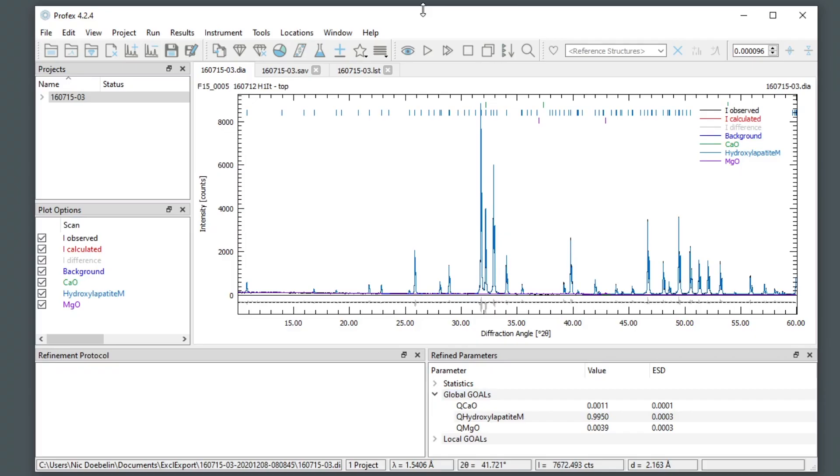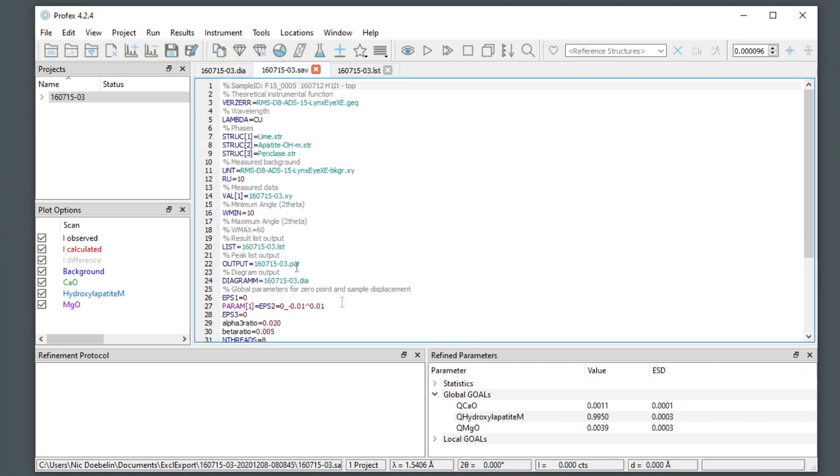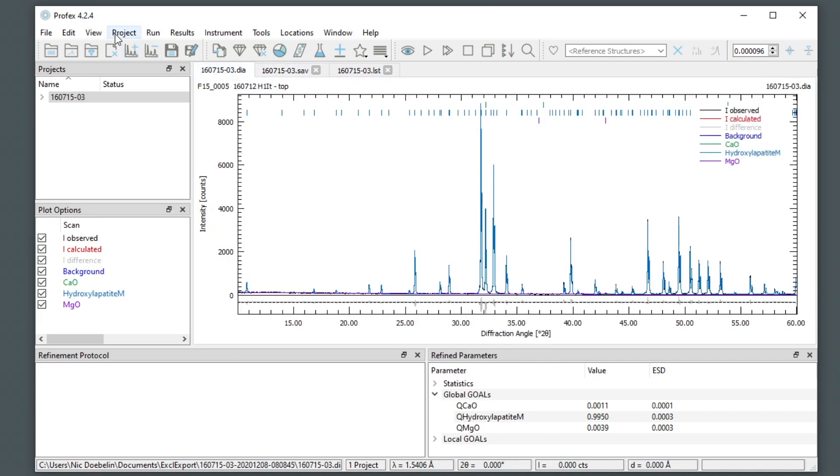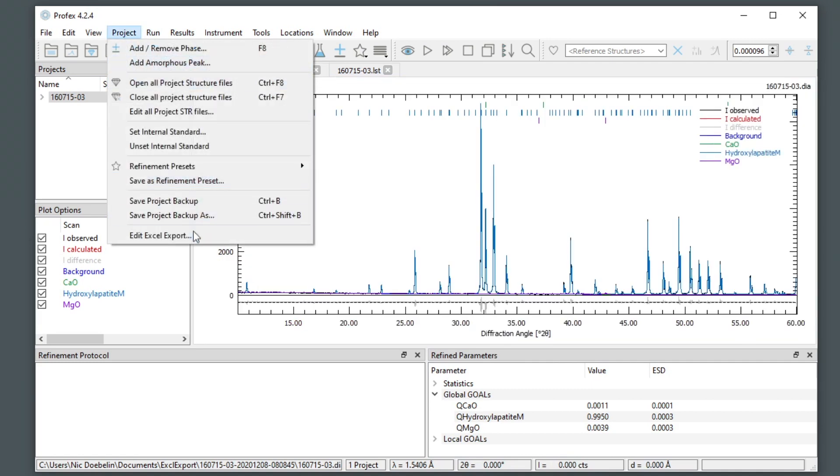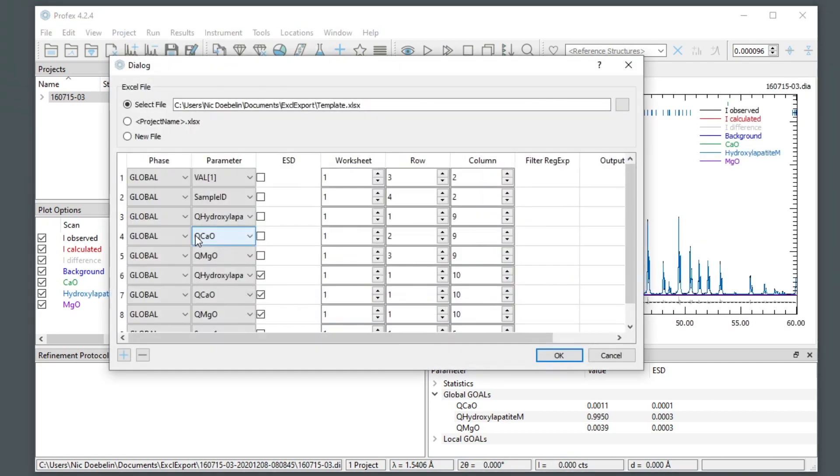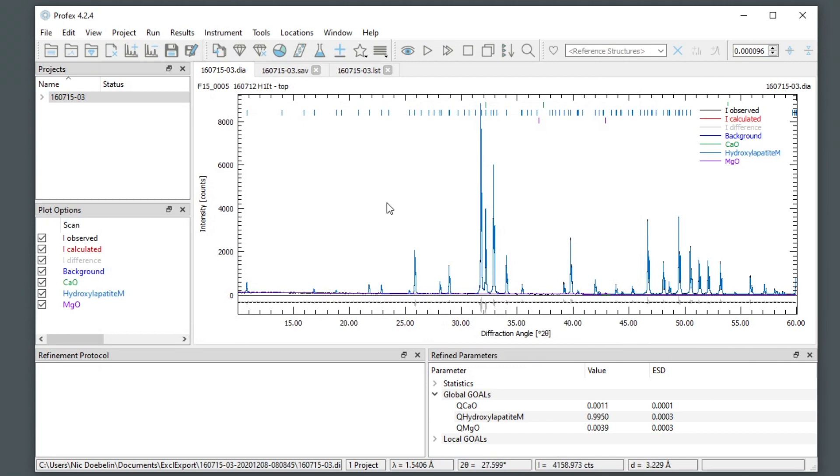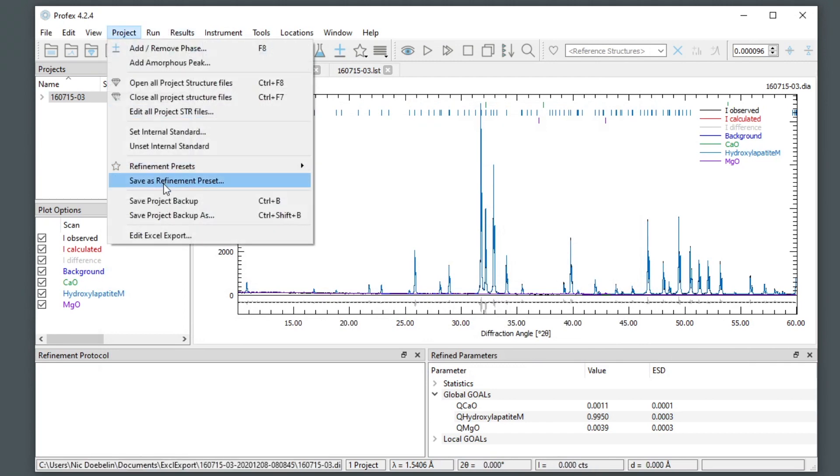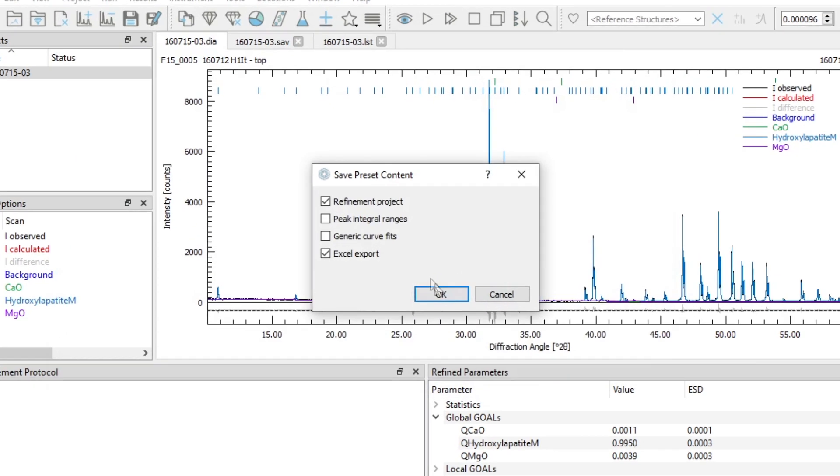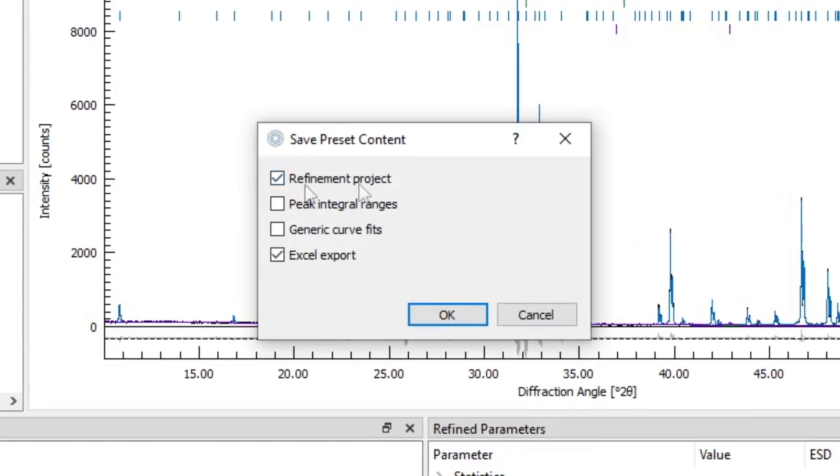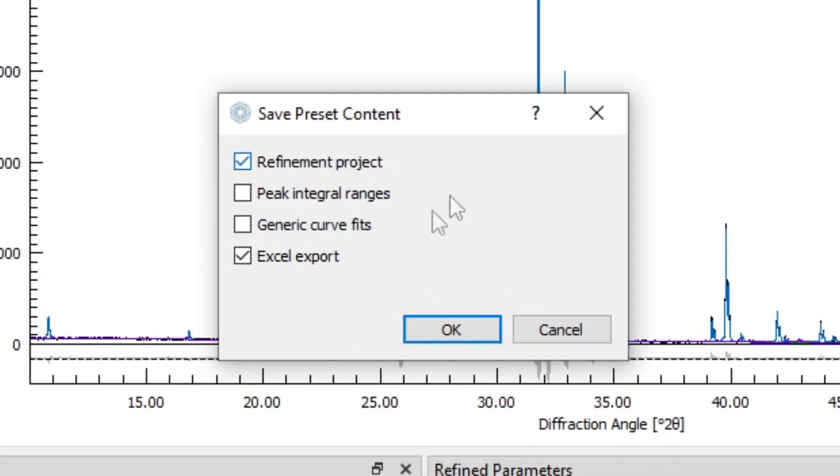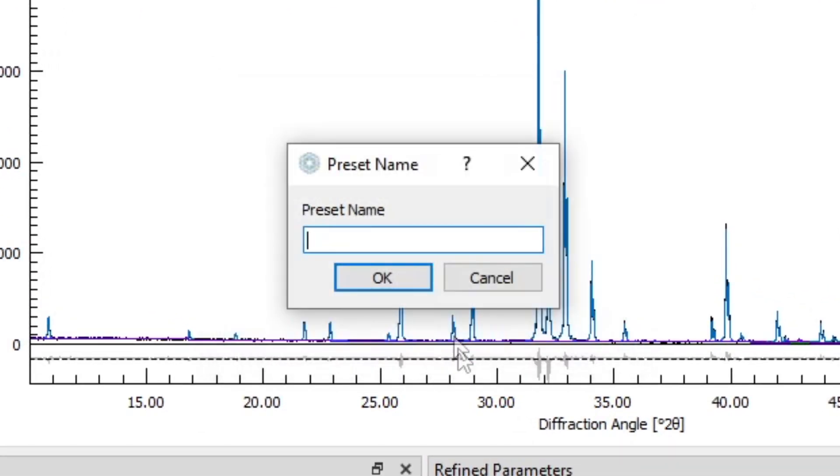Presets for refinement projects and for Excel export are quite convenient. We can, for example, save the refinement project and the export configuration here in the same preset as I mentioned before. So I go to project, save as refinement presets, and I leave the refinement project and the export, the Excel export checked. I give it a new name.